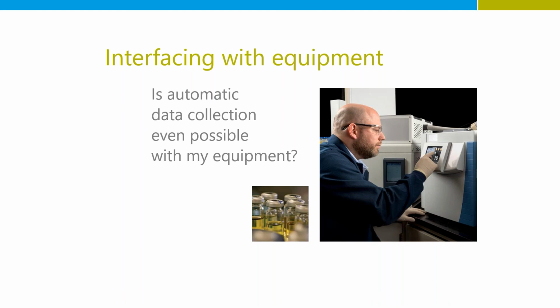Well, he covered a lot of areas where we're talking about networking devices, where things have a PC interface or have some connectivity. If that's really more primitive, it's a serial or USB, that can also be sometimes software controlled. We've done that kind of work before, and really kind of bypass systems where they're entering data manually because there is no interface to it. So it is sometimes possible to retrofit more antiquated equipment.